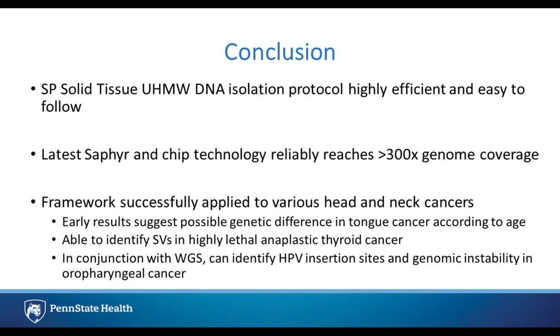Yes, I think there's great potential with using CRISPR for this purpose. I think for optical mapping in particular, it can be helpful. For example, if we're able to determine a way to CRISPR label HPV-16 virus, then we can label these tumors and see exactly what the virus is quite easily, and then based on that we can study it more closely and perhaps not rely on the sequencing to determine what the virus is, and it can kind of speed along the process. But I think it definitely has a great potential and can be applied to different viruses that are oncogenic in nature as well.